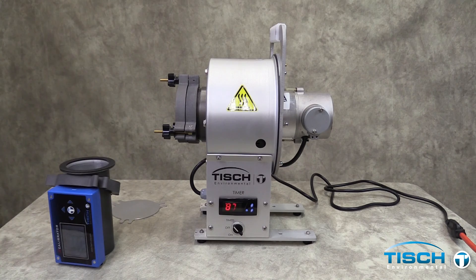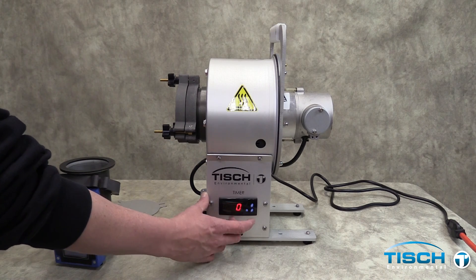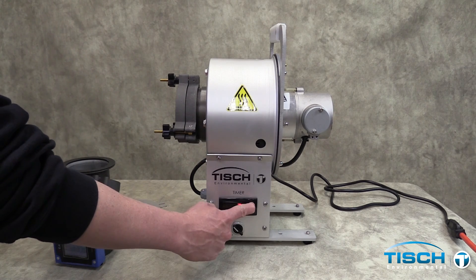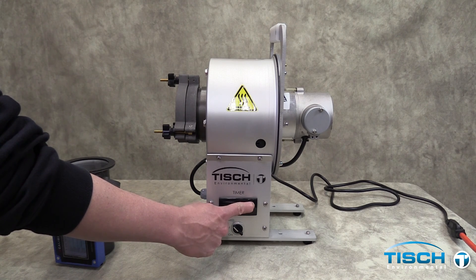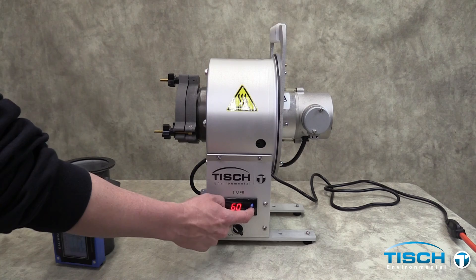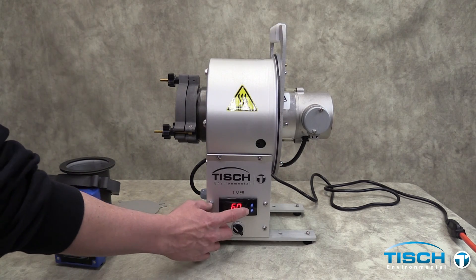Switch to timed. Hit the Set button and set the time to the standard sample time of 60 minutes. Press the Set button to run the sample.